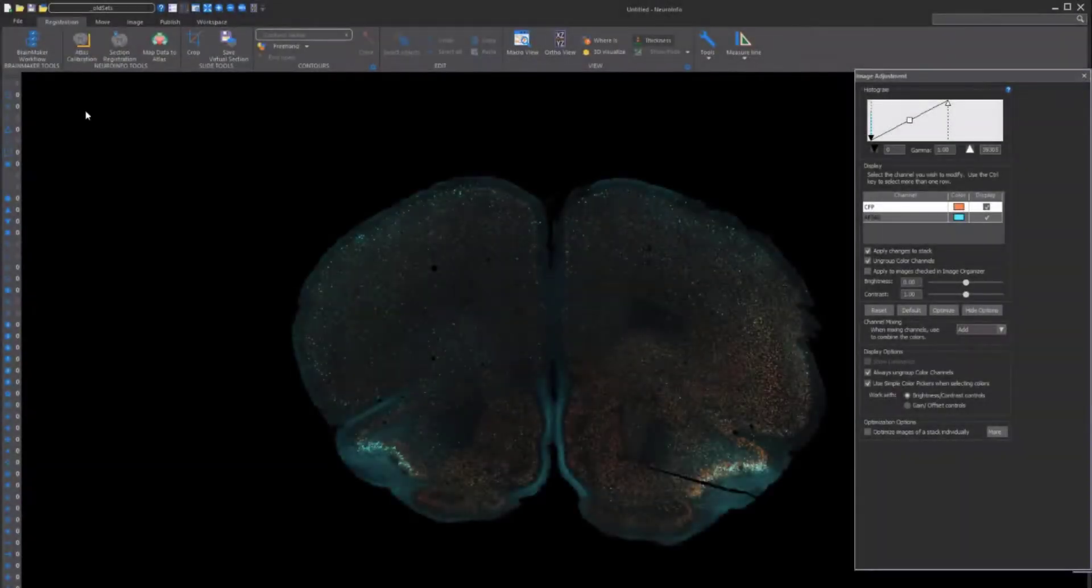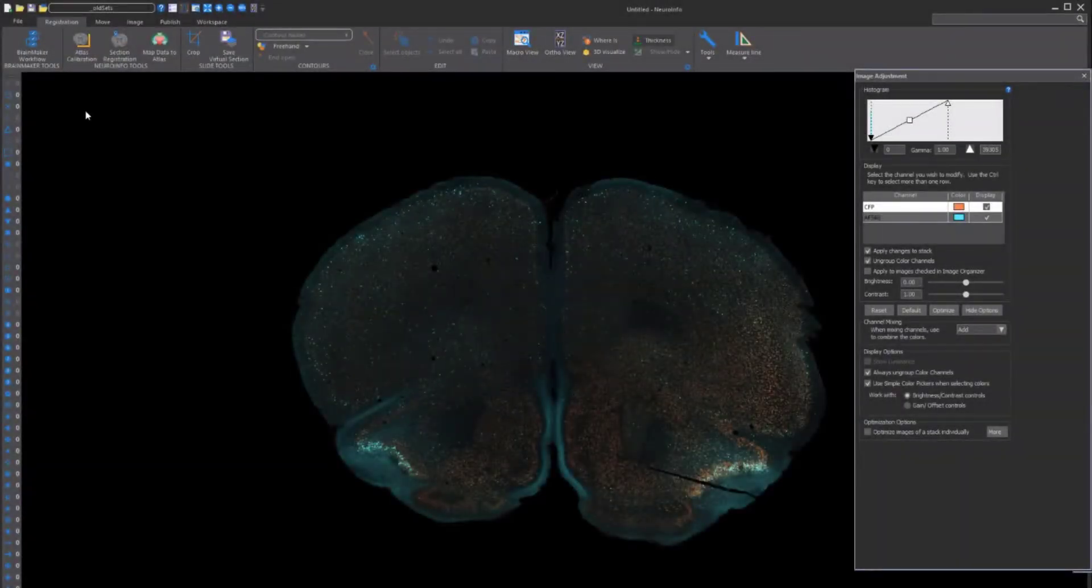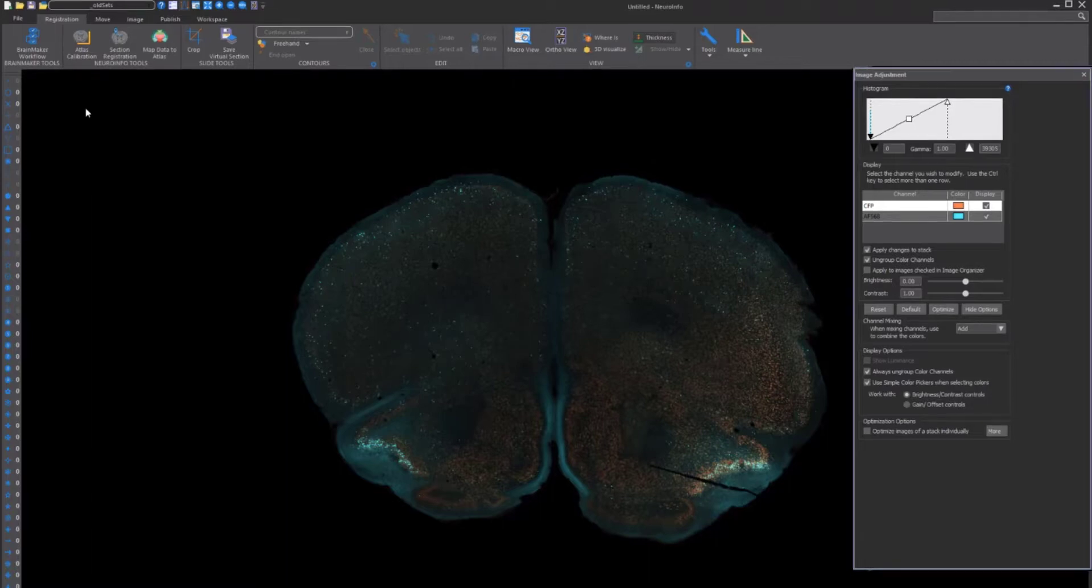Once we have our serial sections registered, we can use the section registration function in Neuroinfo to start making measurements in a standardized reference space. The software automatically detects cells and maps them into the Allen Institute's Common Coordinate Framework, which includes its mouse brain atlas.